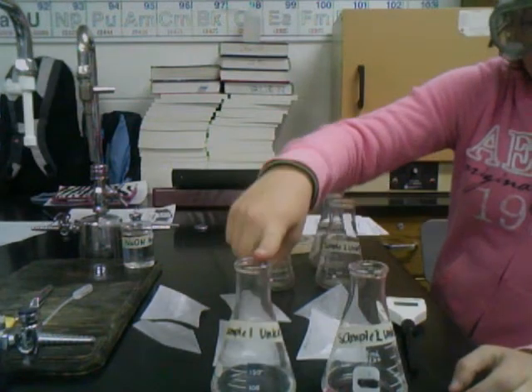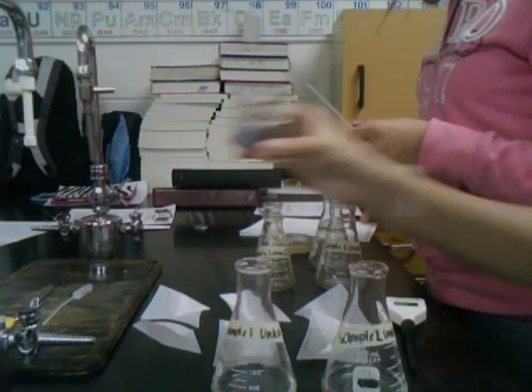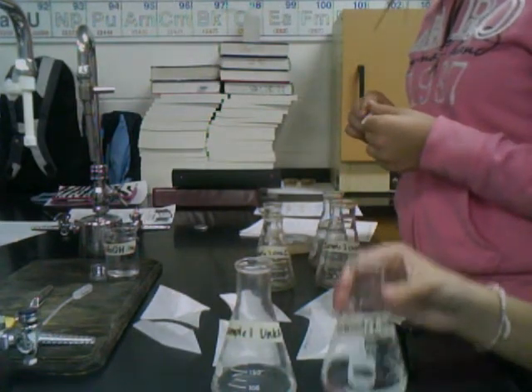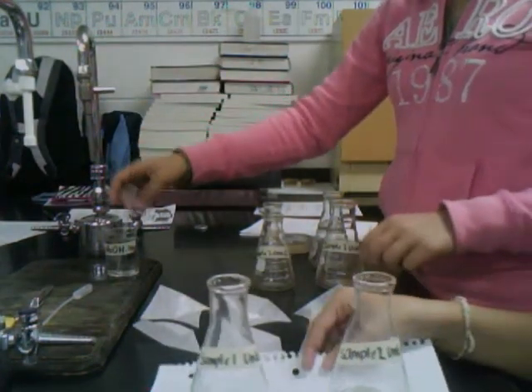This is sample one and this is sample two. We'll be adding 0.1 molar sodium hydroxide dropwise to our samples until it reaches the endpoint, which is when our samples will turn a faint pink color. We'll put a piece of paper under here so we can see the color change.